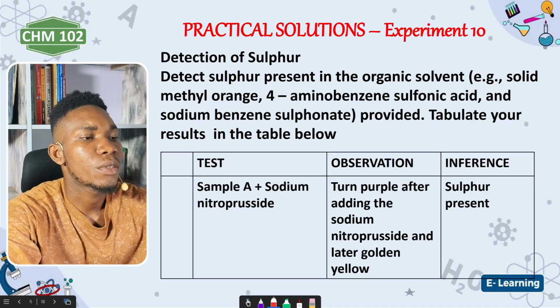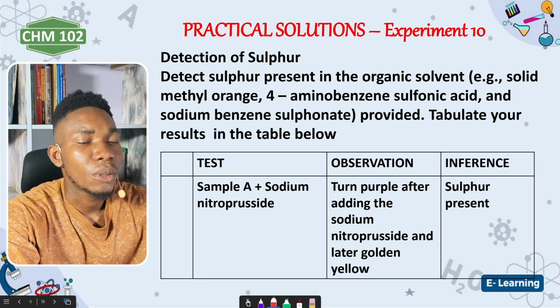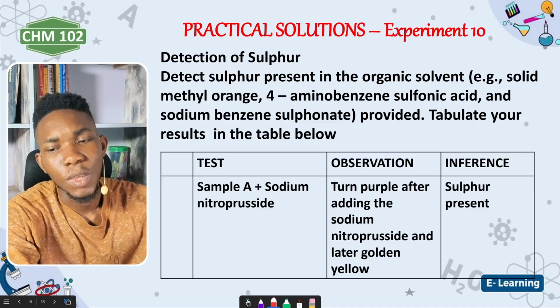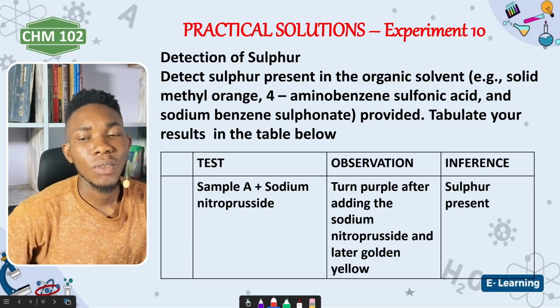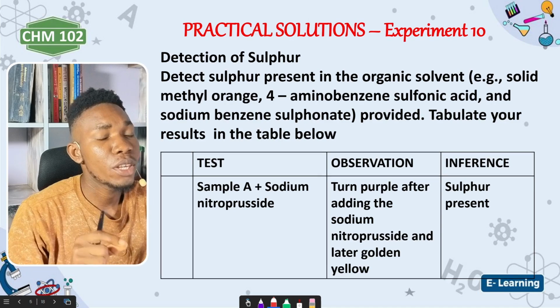It is an easy one, something I want all of you to take note of. All right. Some of you have already written it before, from the result you got in your practical. Like I said, it's a practical. Some of these reagents they might have given to you might be bad. Are you getting it? Some of them might not be fresh reagents. So you'll be expecting a little bit of discrepancy from theoretical values.